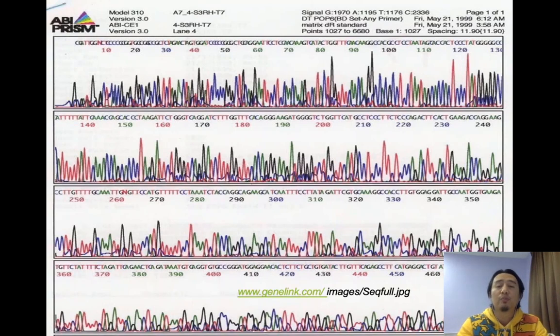So if you have your sequence of recombinant, your gene of interest, and you make the recombinant, then you want to check it after recombination. Sometimes after you make a cloned recombinant DNA, the base is mutated. So we want to avoid those mutations appearing in our recombinant DNA. So that's why we do DNA sequencing after cloning, just to ensure that our gene of interest and the recombinant are aligned, multiple alignment. For the low ones like this, you have to check back.